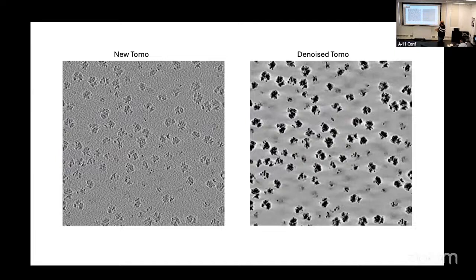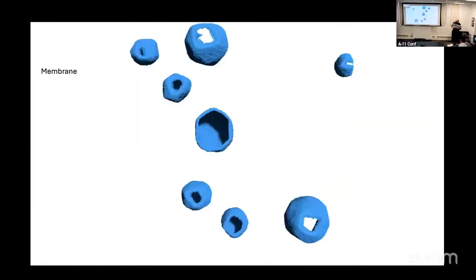Now, here's a new tomogram of ribosome. This is synthetic again. This is our network's regression of it back to our ground truth. Now, it obviously denoises in a very harsh way. Like it literally strips the noise out of it. But we were interested in whether or not we could apply this in some general way to cellular tomograms.